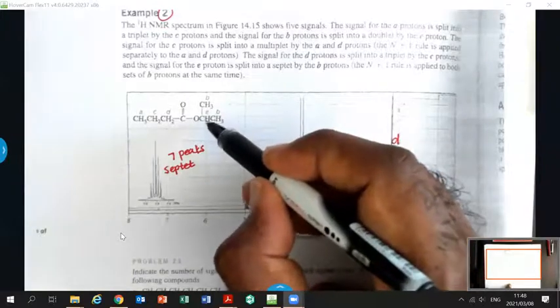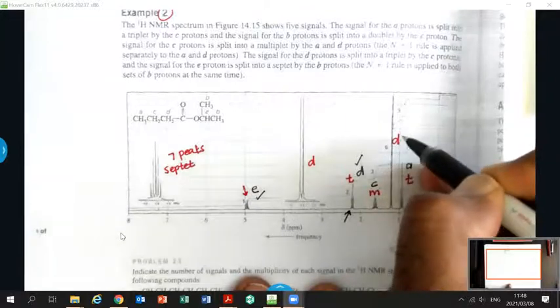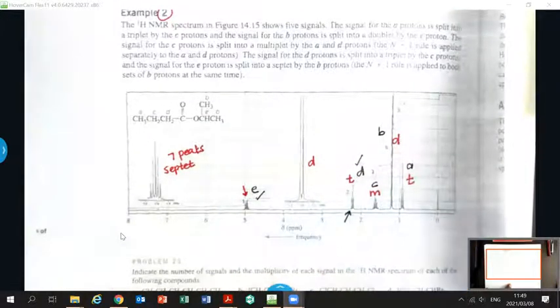And those CH3 groups integrate to 6, like we're seeing it here, right? So this must be my B. All right, so a slightly larger molecule, but you can actually assign all the peaks in that molecule using NMR spectroscopy.